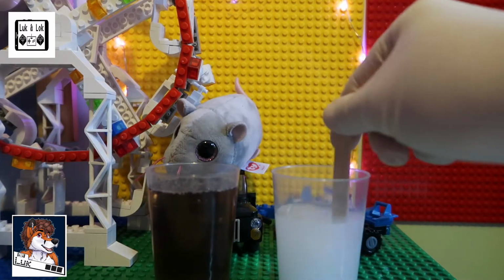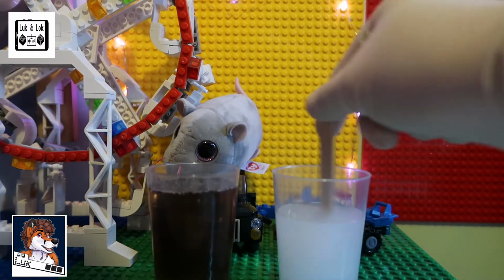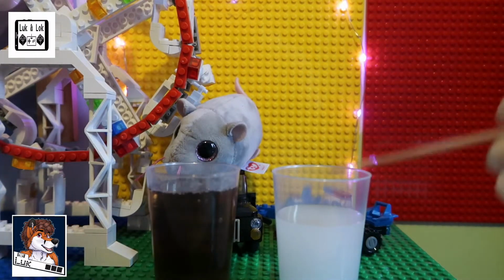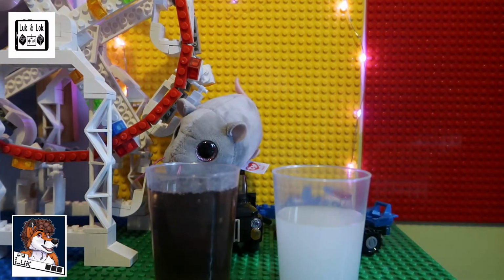There we go. So that's been given a stir. Right, so ow, that hurt. Right, so we are now going to add the pH strip to each.